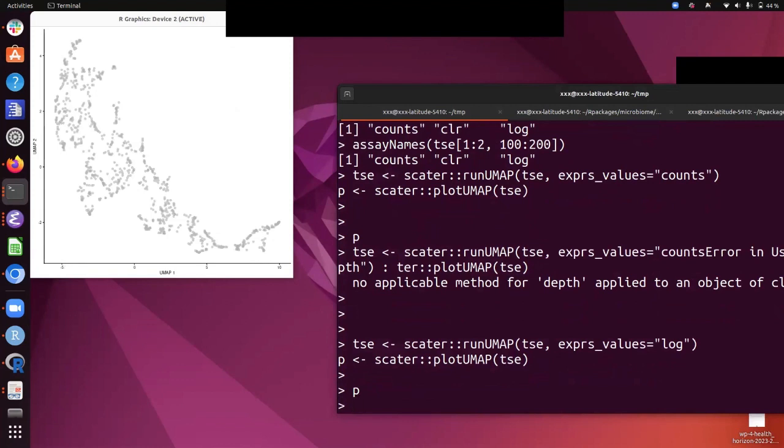It looks like this. Of course, these are just demonstration examples, but this is now all with the time series data that we simulated with the MIA sim package, and that you could do with basically any taxonomic profiling data, if it was real community data or simulated community data. As you can see, it's relatively easy to do subsetting, manipulation, transformations, time series visualizations, ordinations with relatively little coding once you have data in this particular object.